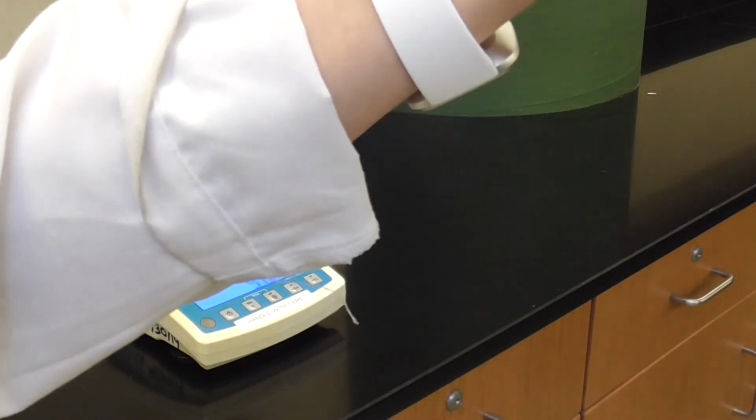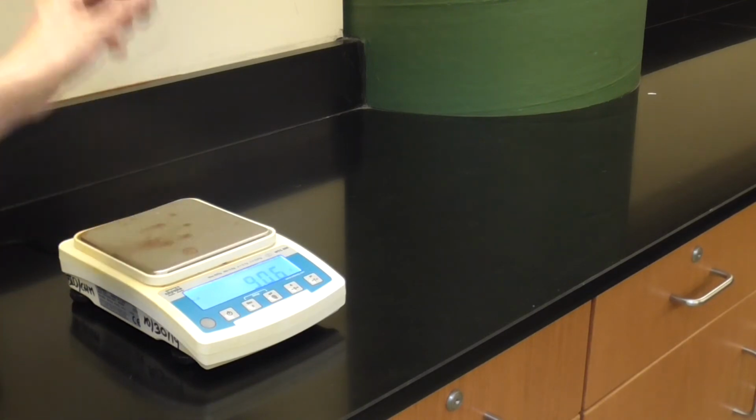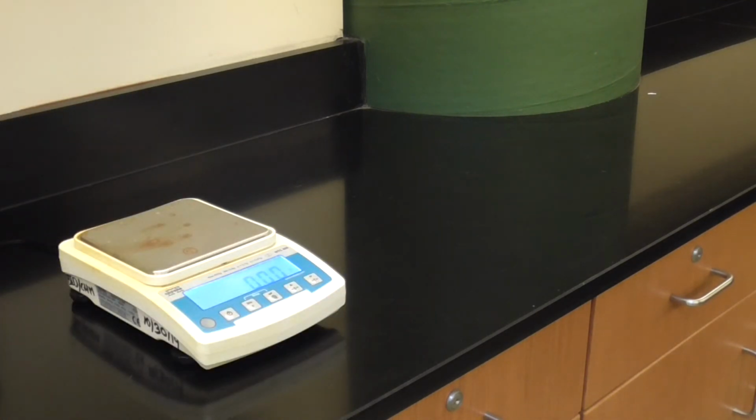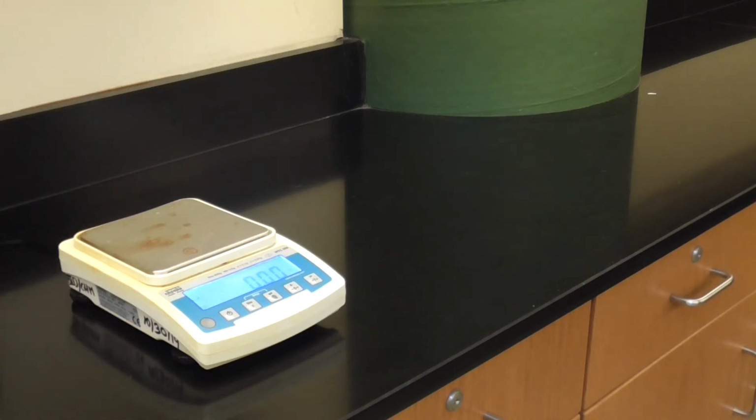You do the same thing with the cylinder. If you want to try both, so you'll get used to it, okay? And so this is how we are going to use the balance. Those are the 2 different types of balance. With the volume, we are using the cylinder, okay? Now, when you're going to measure 5 to 6, use the 10 milliliter cylinder. But for the water displacement, use the 100 ml cylinder. Is everybody okay?